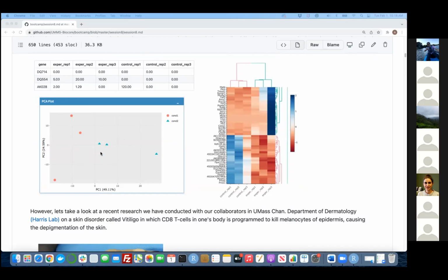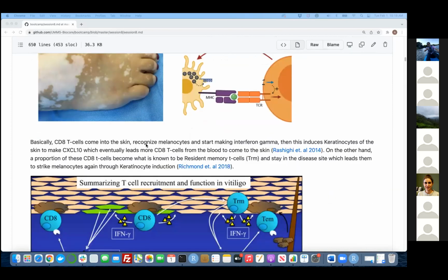You're just validating that there's a fine separation, or you may see that one sample's expression profile is slightly away from the other samples in the same group, which may indicate that its expression profile is slightly different, right? But the funny thing is that we only have one expression profile for each sample over here. So there's not really much room to identify heterogeneous patterns and behaviors in the expression programs.